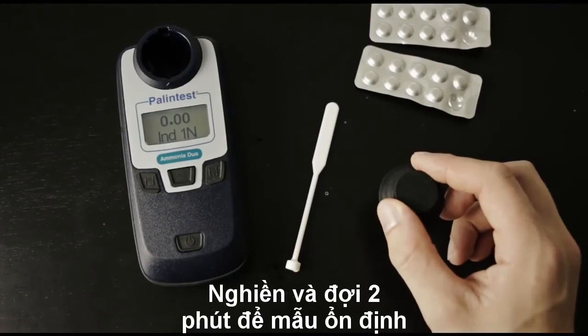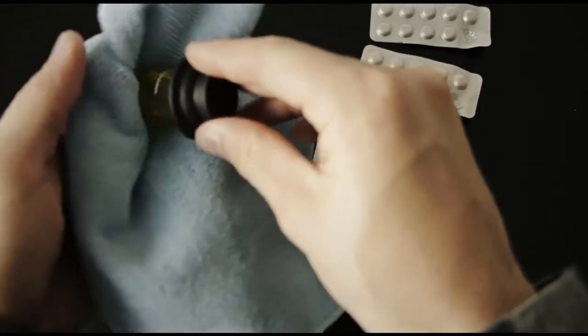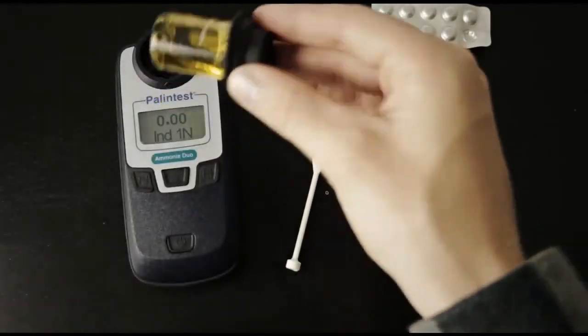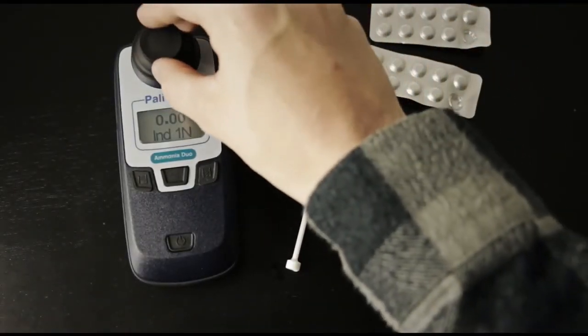When the color is finished developing, make sure that you wipe off the outside of the cuvette to ensure there are no fingerprints. Tilt it side to side to remove any air bubbles, and insert it back into the instrument.